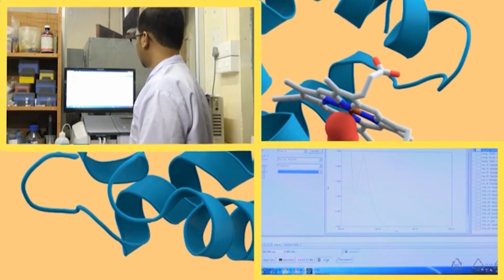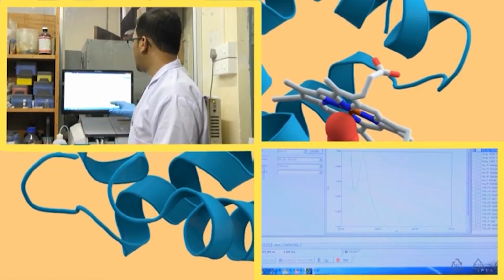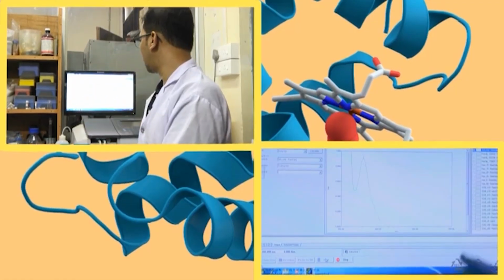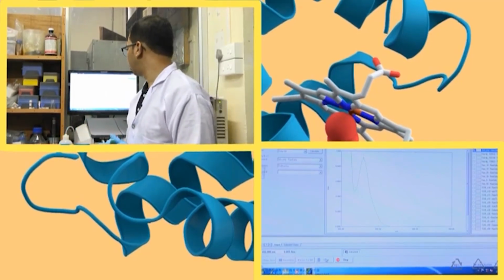After the start. So, as we have seen, this one is also expected to come in a region near to it, because proteins absorb around 270 to 280. So, an overlapping region might take place. Now, here I will be doing 10, 20, 30 or 50, let us see how we can proceed.